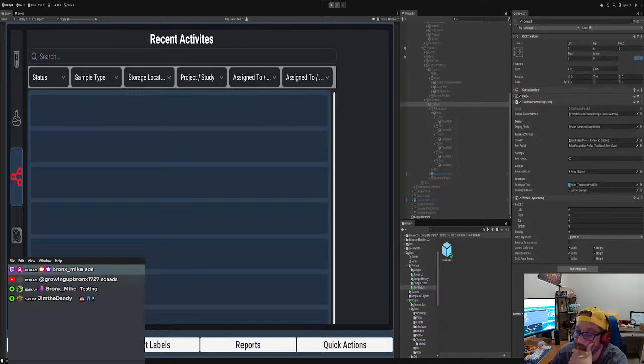Then we got disable. We unsubscribe to the event, and on destroy, we clear out the token. And then we have the refresh button, which when we click on it, it just refreshes. We could do that later. Display field. Oh yeah, I forgot. Do that. You don't need the display field here.